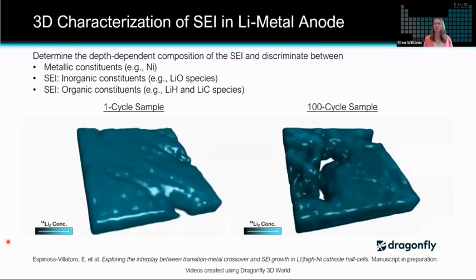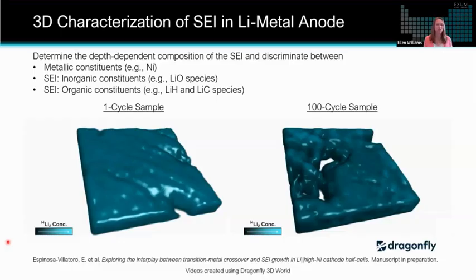But yeah, once again, just providing that picture of how this technique can complement the other analytical techniques and identify things that are not easily identified with those other techniques, and very impactful for SEI studies on these new promising battery chemistries.